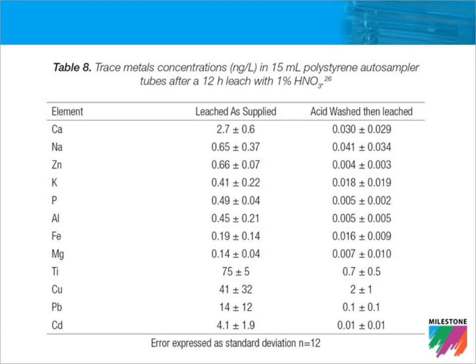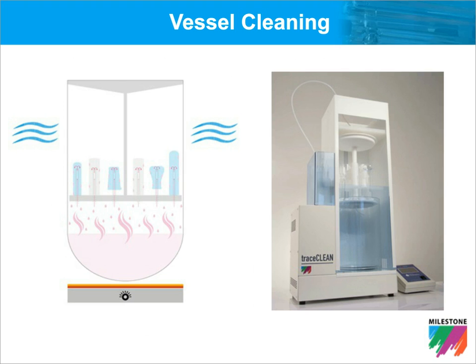In this sense, it's important that we use equipment for acid cleaning when we need to go down for really low concentration levels. Of course, acid cleaning has a pronounced effect on analytical blanks. Tim will talk about this later on.